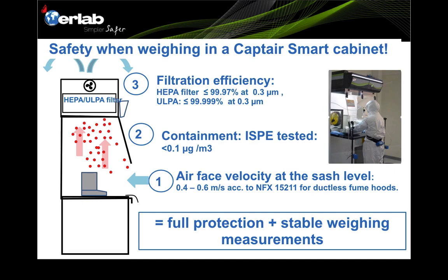This slide shows how the Captair Smart filtered fume hood provides full protection and a stable weighing environment. At the sash opening, the face velocity is maintained within 0.4 to 0.6 meters per second according to NFX 15211 standards, and it also complies with local DOSH requirements for fume hoods. Having passed the ISPE containment test with results below 0.1 micrograms per cubic meter, the Captair Smart is suitable for OEB 3, 4, 5, and 6 applications. Filtration options include both HEPA and ULPA filters.